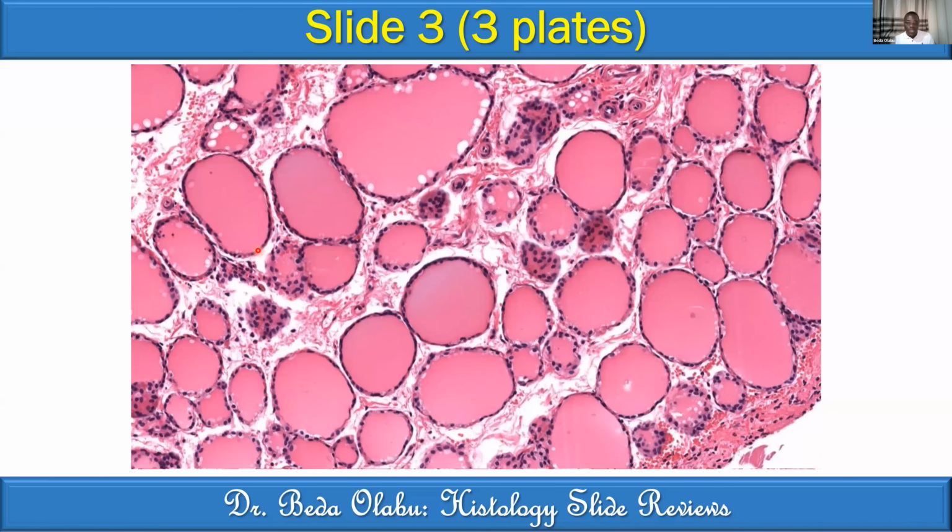We expect you, if you're describing histological organization of the thyroid gland, that you talk about organization of the stromal tissue, as we've stated, and organization of the parenchyma, as you've stated. We also expect you then to talk about how the follicles behave or appear depending on the functional state of this organ.